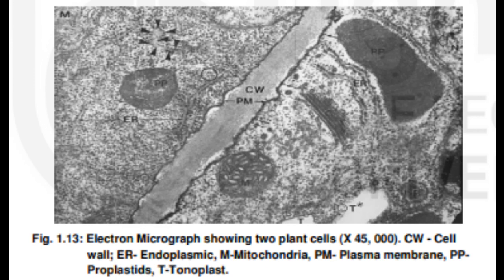The image is produced when the electron beam is focused into an intense spot on the surface of the specimen. The spot is moved back and forth across the specimen by charged plates called beam deflectors. These deflectors are located between the condenser lens and the specimen. The signals sent by the deflector attract or repel the beam.